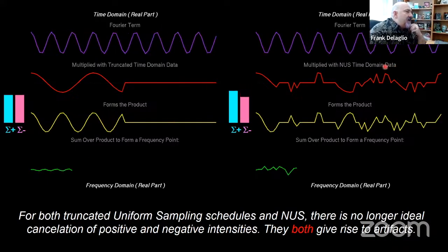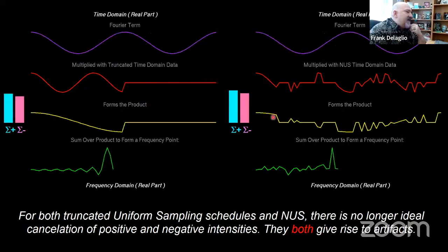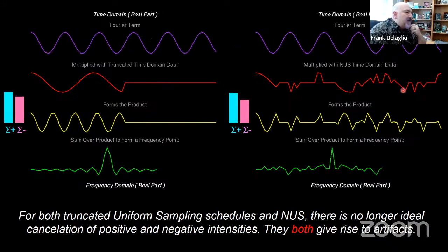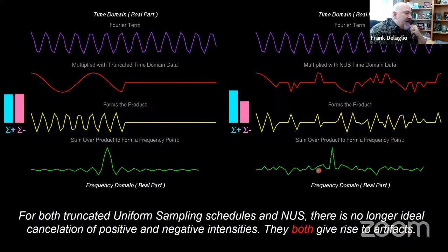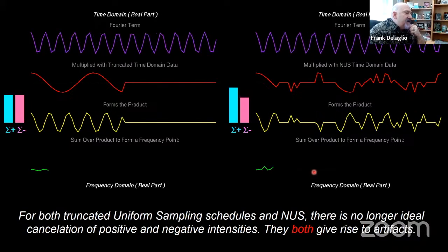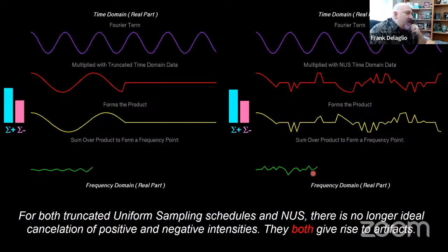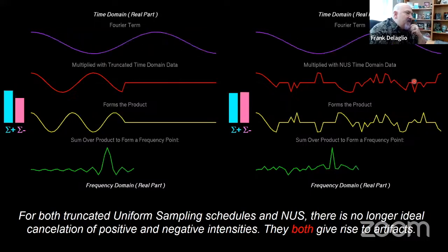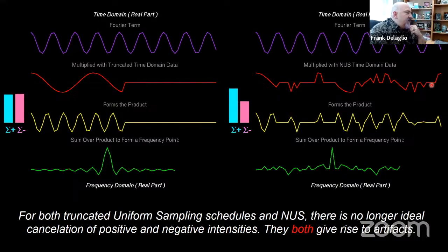And in the case of non-uniform sampling, where instead of having the gap at the end of the data, we have little gaps inside of the data, when we Fourier transform data like this, we get a nice sharp signal, but we get apparently noise-like artifacts that look random. They're not random, though. They are completely determined by the pattern of points that we kept and the pattern of points that we skipped when our non-uniform sampling measurement was made.